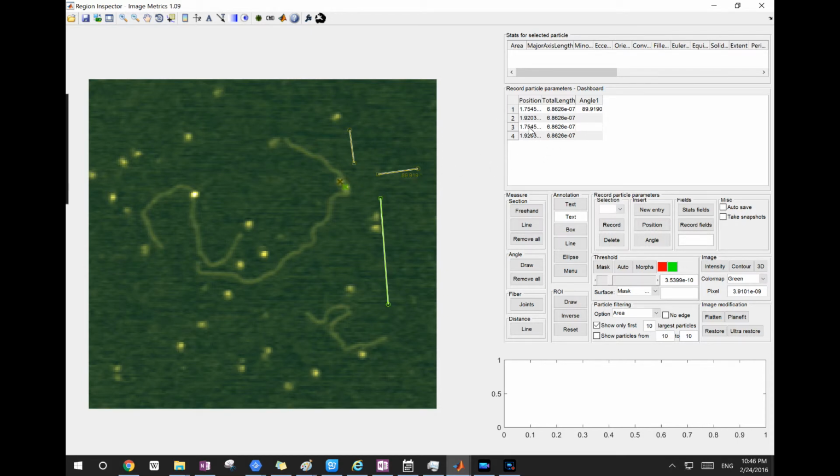Because there are duplicate measurements on rows 3 and 4, because I made the same measurements twice, I should really delete them for now for simplicity. So all I need to do is select two cells, using control click to select multiple cells. So I select two rows, and you can right click the table and say delete row, and that gets rid of them.